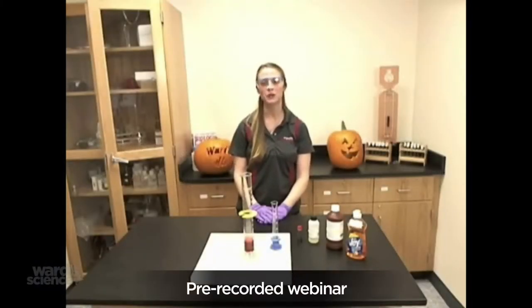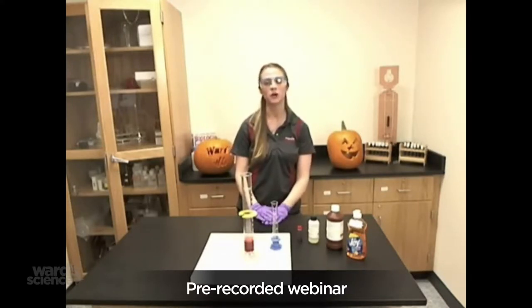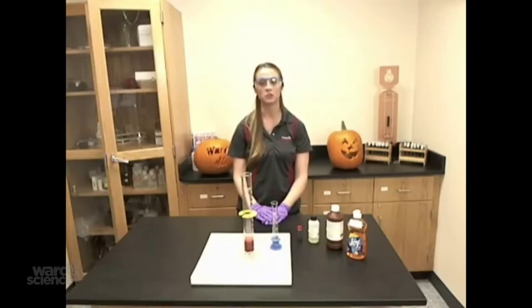Hi, I'm Teresa from Wards Science and in this video I will be showing you how to perform the tube of toothpaste demonstration, Wards item 9821110.